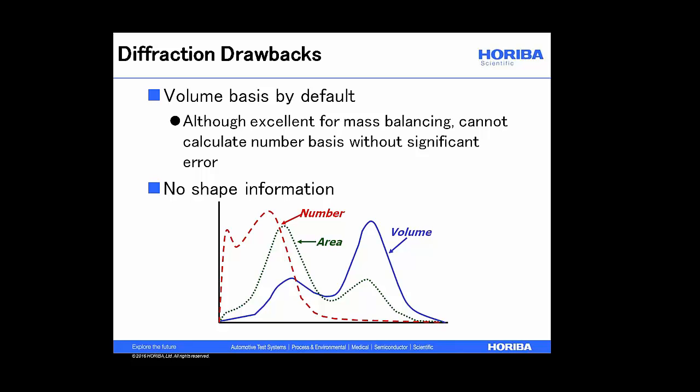The second concern about laser diffraction is that you don't have any shape information. So if you dump a sample into a laser diffraction instrument, you're going to get a nice repeatable size distribution, but you won't know anything about particle shape. And that is interesting for some applications.